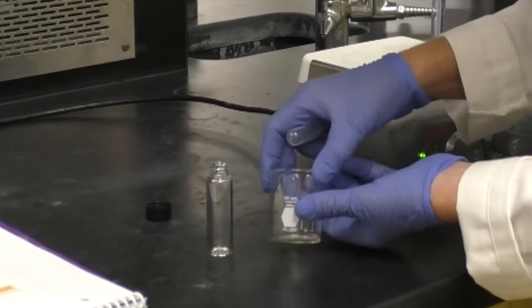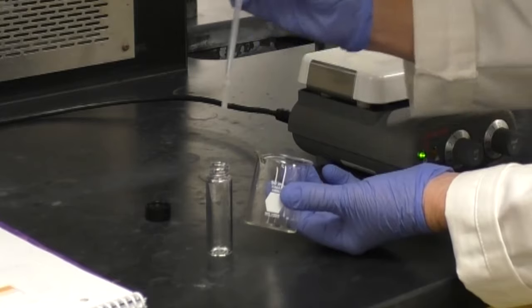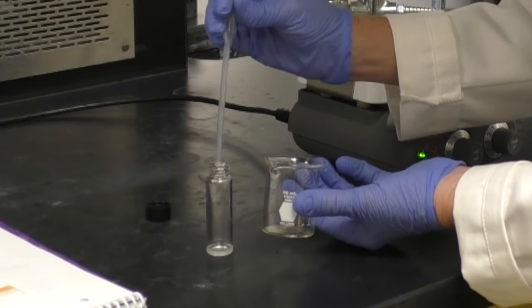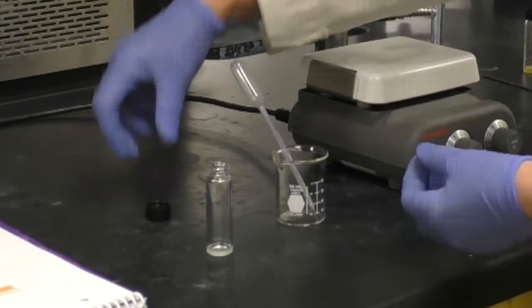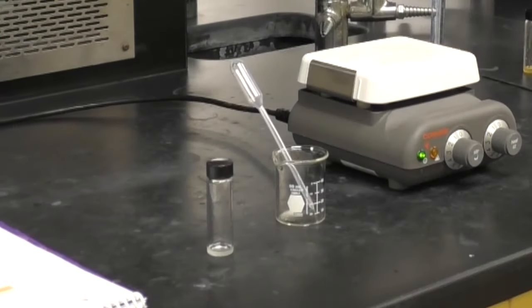Pre-weigh another 4-dram vial and record the weight. Pipet the limonene from the beaker into the vial. Weigh it and record the mass. Label the vial as limonene.